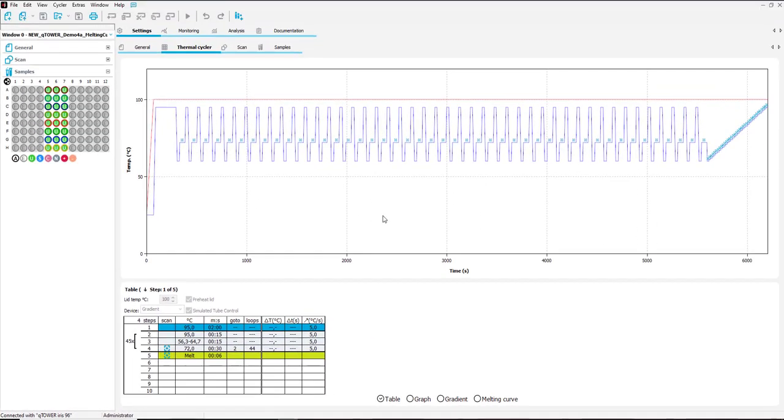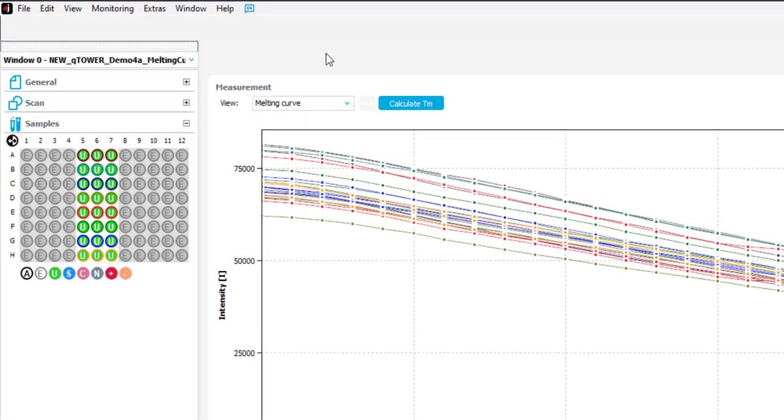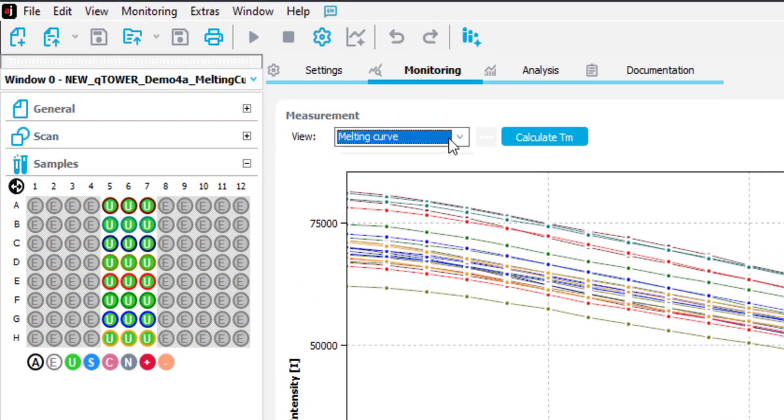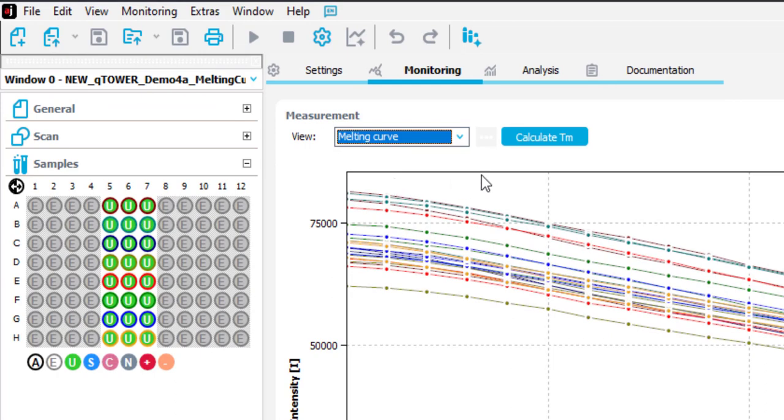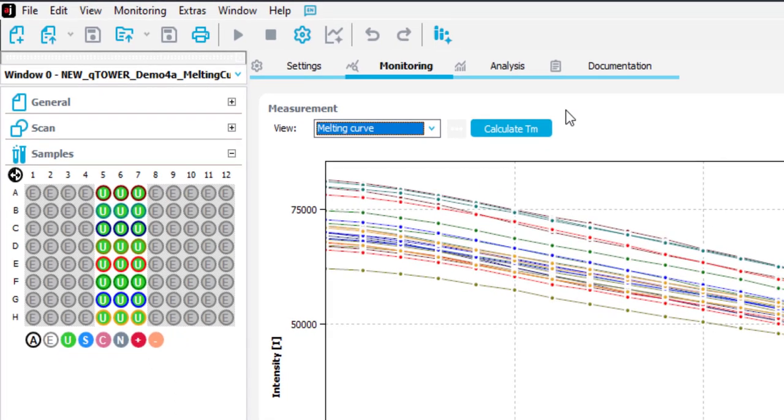In the monitoring view you can have a first glance on the melting curve results and already calculate the TM via this icon.